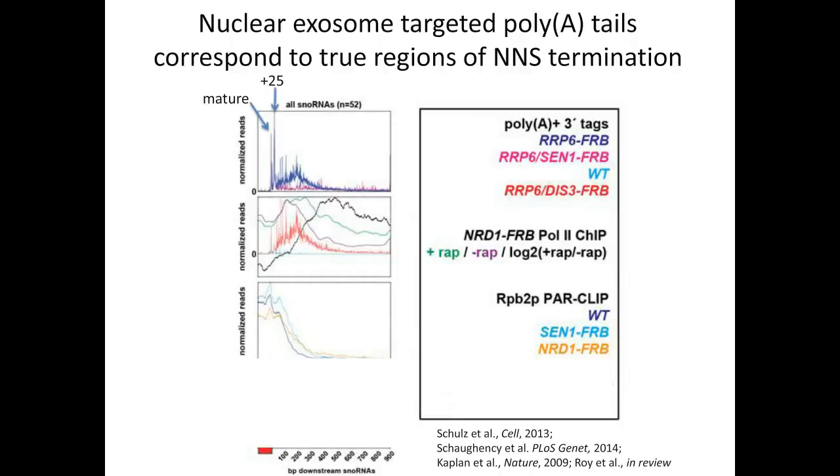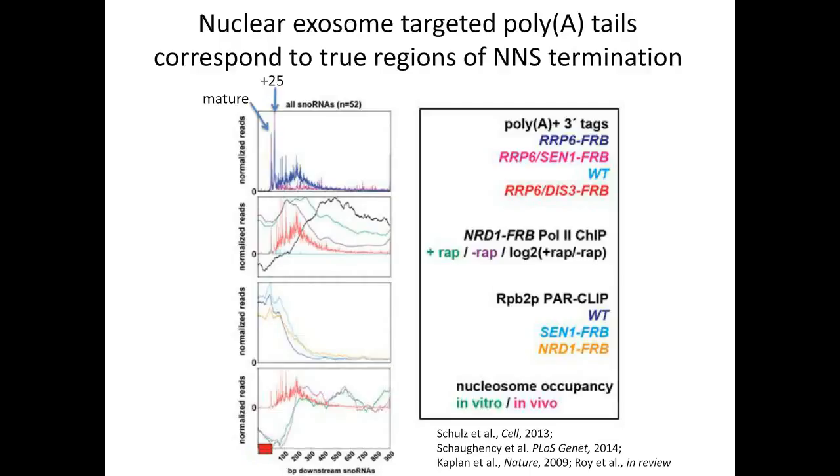The SEN1 inactivation gives a higher level throughout, so it's harder to interpret the termination site from the SEN1 inactivation. So when we looked at other factors that might be involved in termination, we mapped these poly A tails onto the nucleosome occupancy, and we noticed that when the nucleosome occupancy began to increase downstream of these snoRNAs, the major termination peaks were coinciding with the nucleosome occupancy peaks.